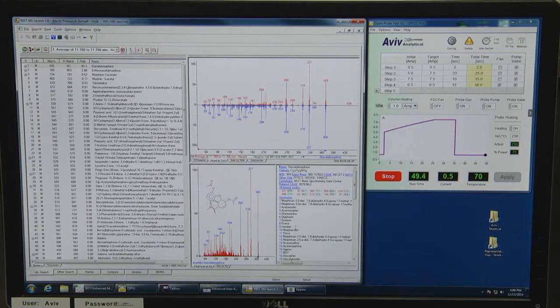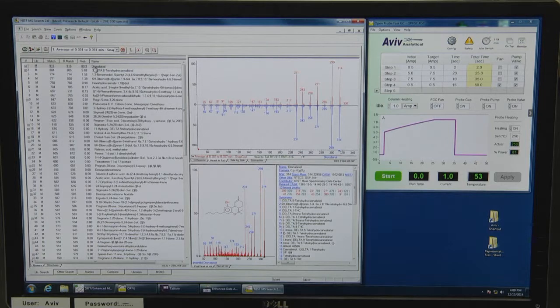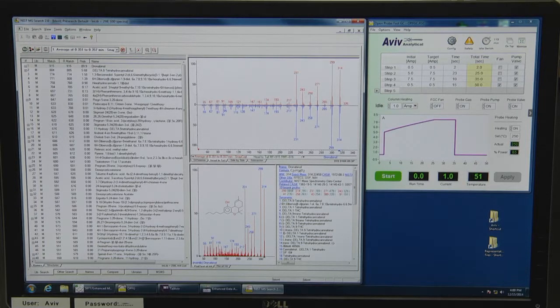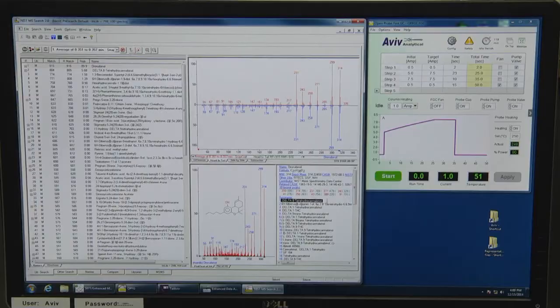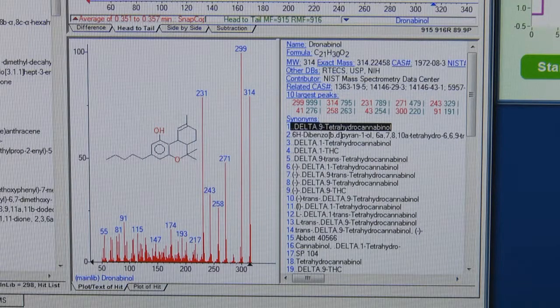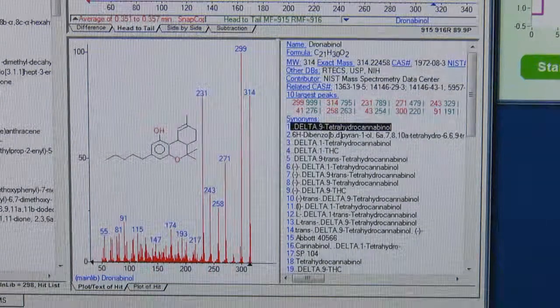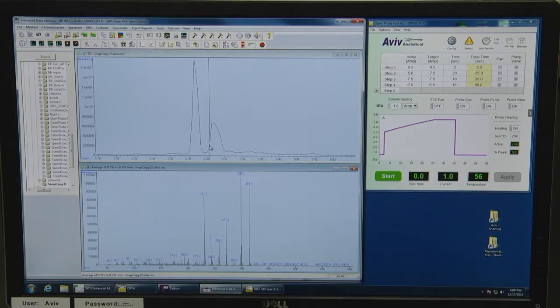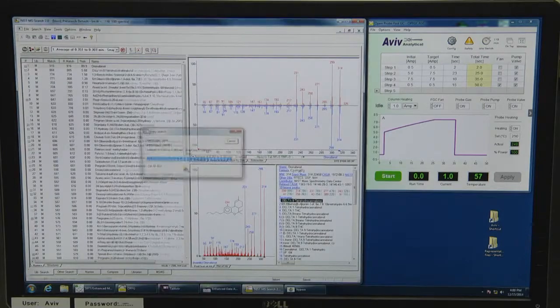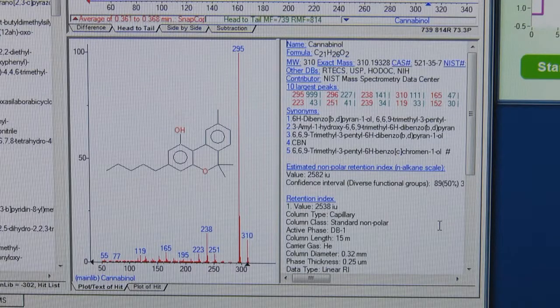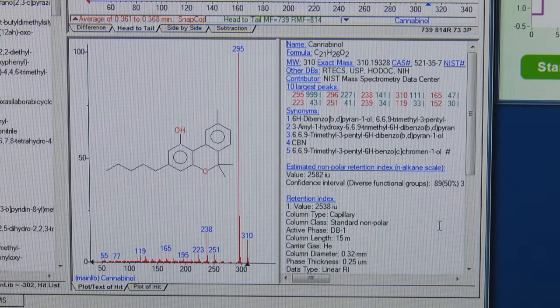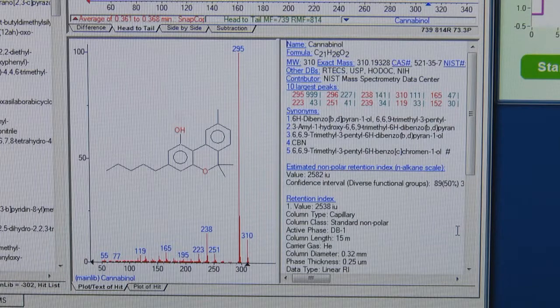Double right mouse click sends the data for NIST library search, which provides dronabinol (which is another name for 9-delta tetrahydrocannabinol) as the first NIST hit list with approximately 90% identification probability. We can now repeat this procedure for the NIST identification of cannabinol, which provides 92.4% identification probability.